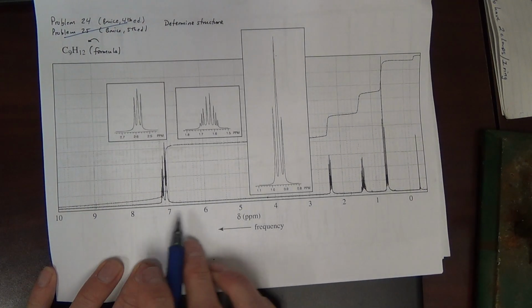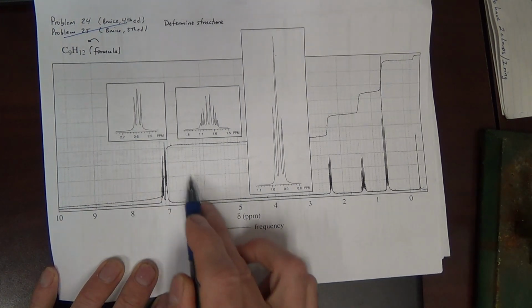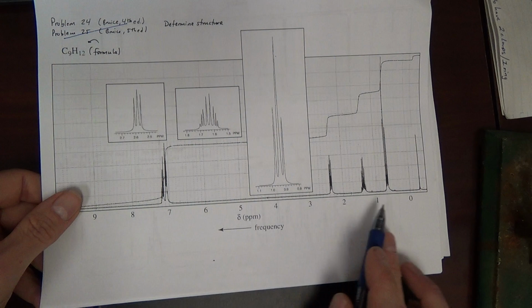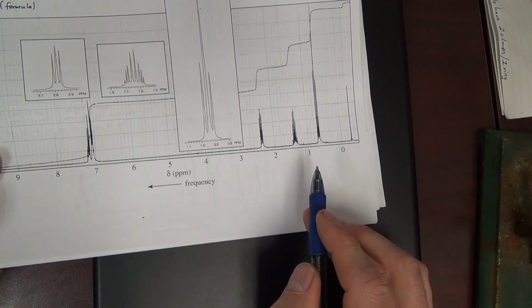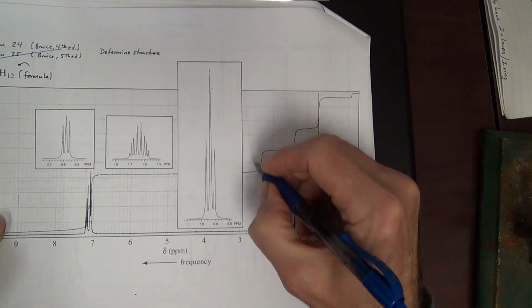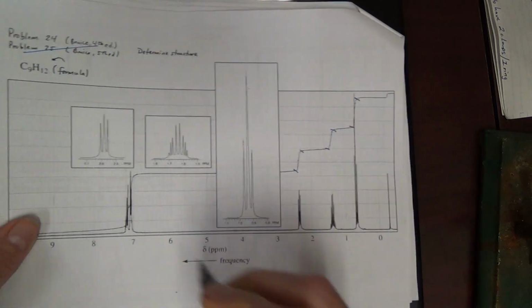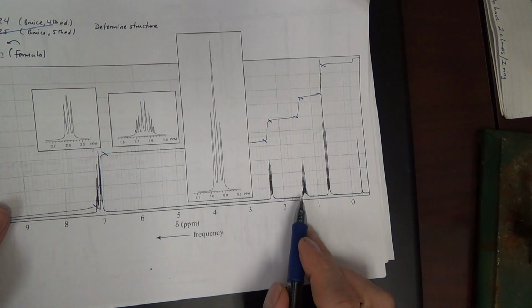Basically you need to remember what each signal tells us. For example, what type of H's give signals in the 7 to 8 range? Because this is a proton NMR. We're only looking at H's. What type of H's give signals in this range? Your integration is given by an integral line. Remember, we need to cut that like this and measure it. Integral line. Some peaks have been expanded.